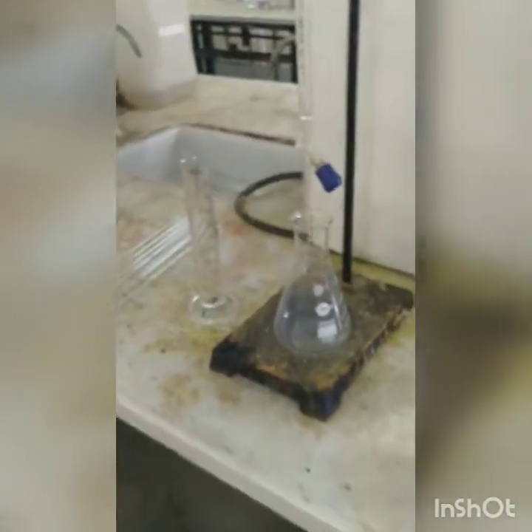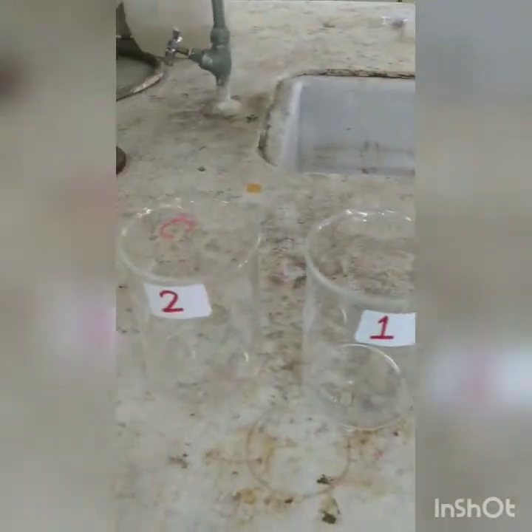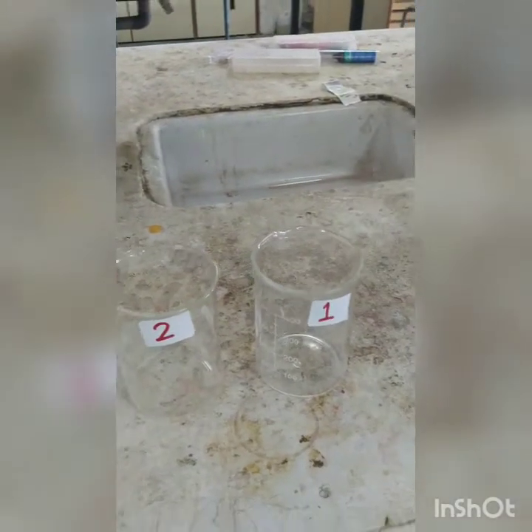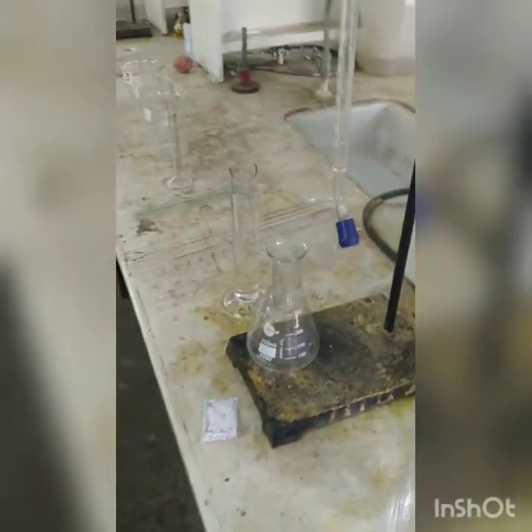10 ml. Then as usual distilled water, and again the glassware as usual: the conical flask, the burette, the measuring cylinder, the pipettes. We require stirrers, so stirrers we will be making use of. Then a 10 ml measuring cylinder, and these are the 4 beakers 1, 2, 3 and 4, to which we are going to add varying concentration of chlorine from the given chlorine solution. So now let us start with the first part, that is the standardization of titrant.